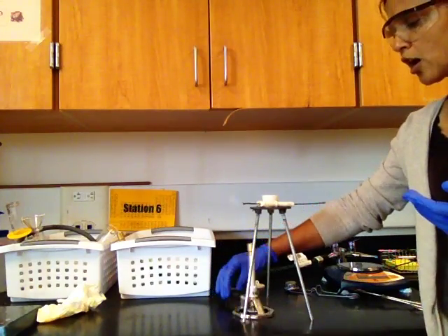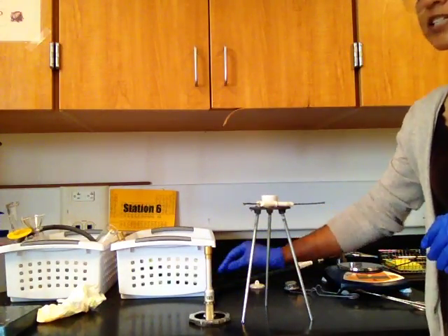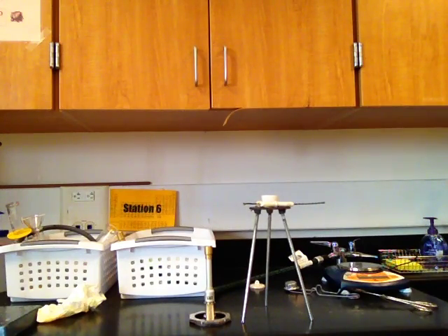Now you're going to strongly heat the hydrate sample for 5 minutes to drive off all the water from it. After heating it up for 5 minutes, you again cool the crucible and hydrate and take its mass. Repeat the procedure until the mass is constant to make sure all the water has been driven off. After you're done with the experiment, you will have 3 sets of data: mass of empty crucible, mass of crucible plus hydrate, and mass of crucible plus hydrate after you've driven off the water, so the anhydrous compound. Using these 3, you can calculate the formula of a hydrate.